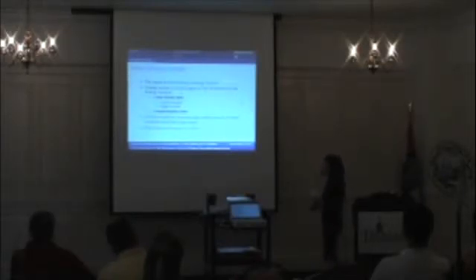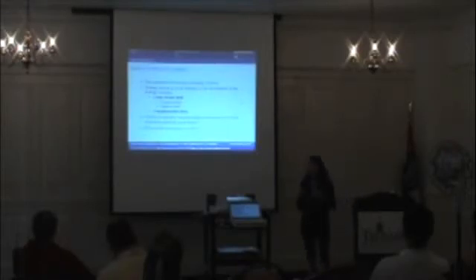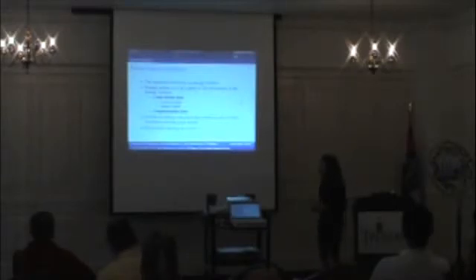Data-driven terms have two classes. Going back to the overall picture, these two main classes are contour-based methods versus region-based methods. Either of these can be implemented in a data-driven term. Right now we'll just focus on contour-based ones. Contours bound maximal edge evidence with minimal curvature to find curve length. And doing this encounters different problems. First and foremost, there are topological problems. It's often really prone to self-intersection, and that's not really good.